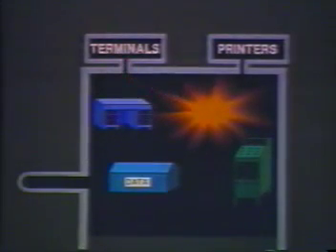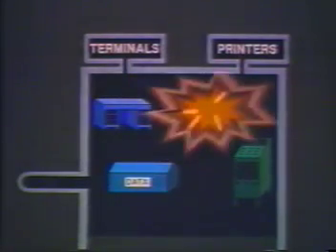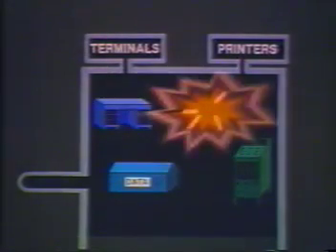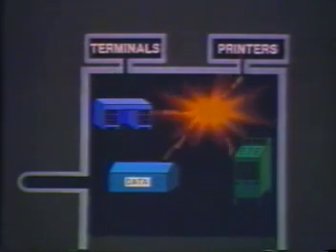It accepts the one and two keystroke commands you type on your keyboard and translates them into work orders for the microworld. It keeps the drawers organized on your desk, controls data collections, transfers jobs amongst the facilities, schedules printer and video output, and lets you know what's happening as your jobs progress.